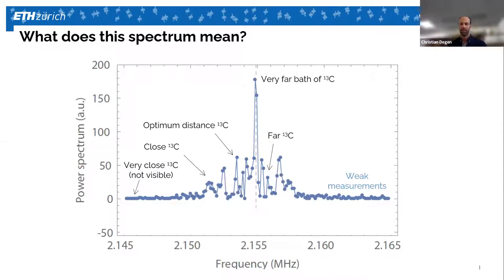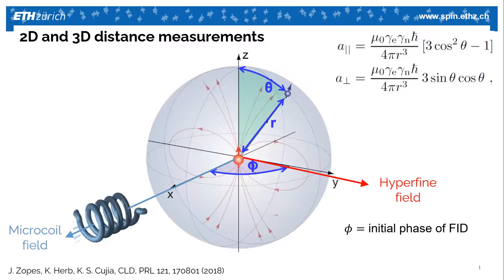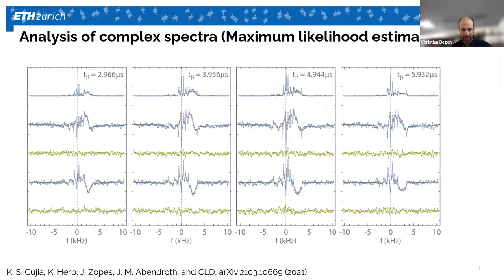Okay. Yeah. All right. And your other spectra, the series of spectra that you showed, they also look like those. Now how are you doing your quadrature detection here? We're just phase shifting the laser light by 90 degrees? No, so it's an indirect sampling of the FID. We use TPPI.